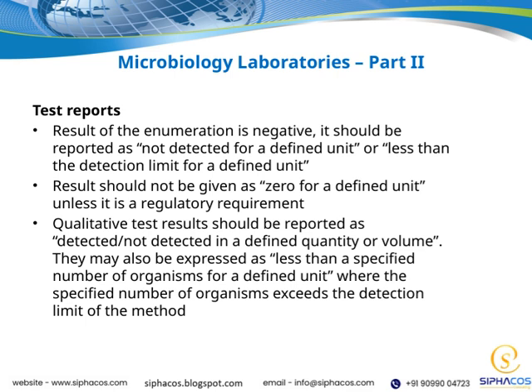For qualitative test results, the standard reporting language is detected or not detected in a specific quantity or volume. Sometimes, it can also be expressed as less than a specified number of organisms for a defined unit, especially when the number exceeds the detection limit of the method used. Understanding these nuances ensures clear communication and proper interpretation of microbiological test results, which is essential as we move forward in this presentation on microbiology laboratories and their methods.